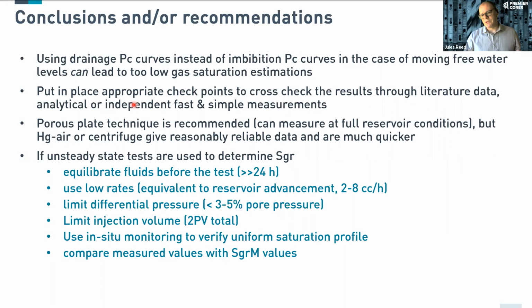The porous plate technique is often recommended, because there you can have gas pressures and fluid pressures and maintain all of the pressures, but it requires reservoir or higher pressures, and not so many labs can do that.